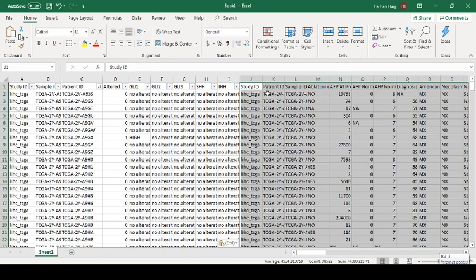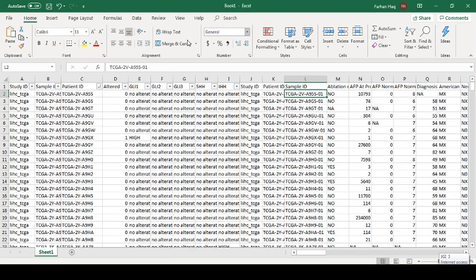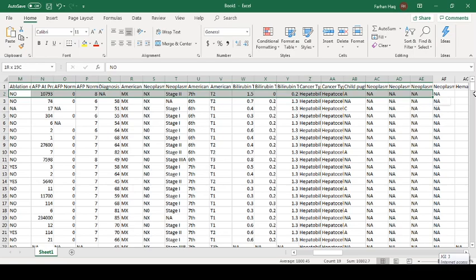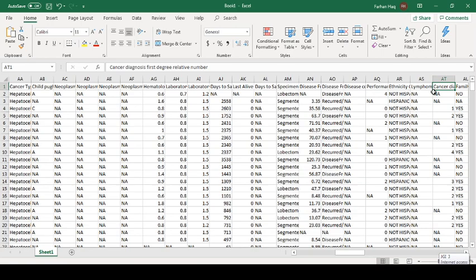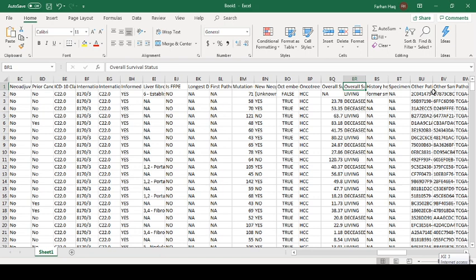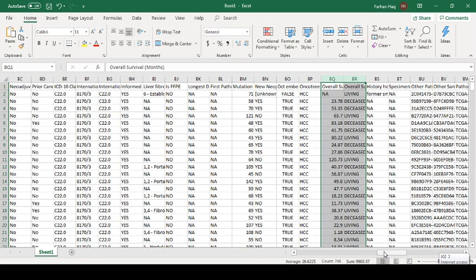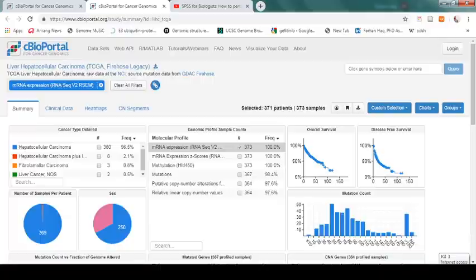Now this sample — for instance A95S — has expression information and clinical information. If you want to find the association with different clinical features — for example, let us suppose we have done survival analysis using cBioPortal — we can find the survival analysis information here. This is the overall survival information: whether the patient is deceased or living, and how much time they have been followed up — for example 53 months. So we can use these two inputs and the gene expression information to perform the survival analysis, which I have explained in detail in my tutorials.